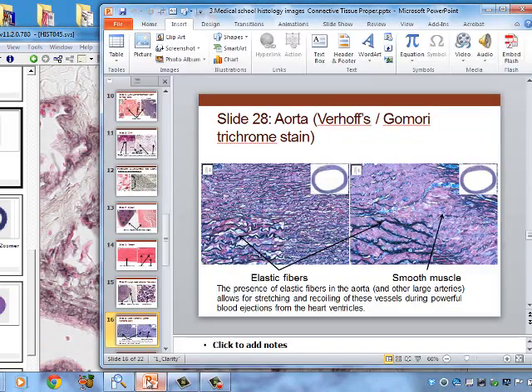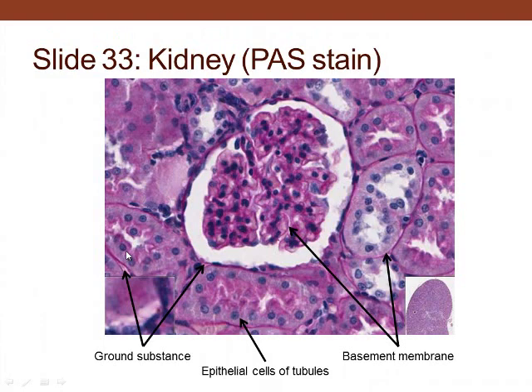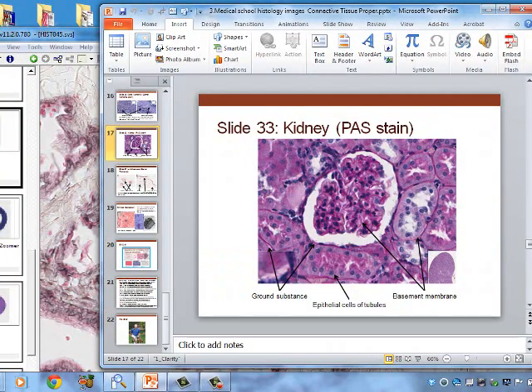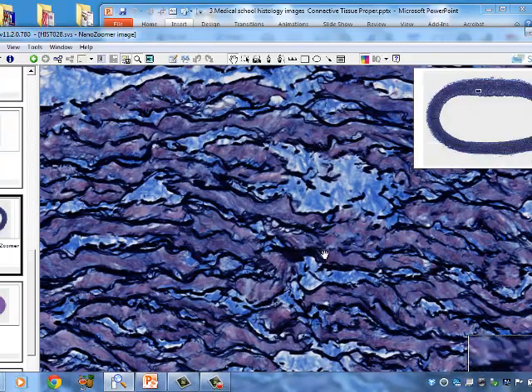The next image is the aorta, using a special stain to highlight elastic fibers. Between the elastic fibers are smooth muscle cells — the typical cell type in blood vessels. Since the vessel is somewhat contracted, the elastic fibers appear as squiggly lines, but they would straighten if the vessel were stretched.